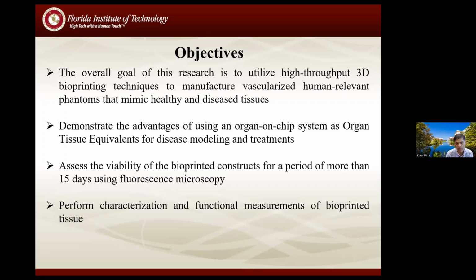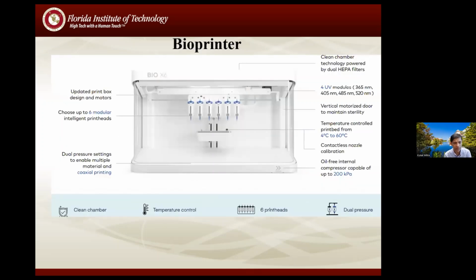But right now, we are targeting missions that will be more like 15 days, because we have to make sure that at least we can do that level convincingly. Or we are actually more at 30 days, but some of the papers are still ongoing, in publication and under review. So far, we have shown easily 15 days, and then we do a lot of characterization and perform measurements of these bioprinted tissues that can maintain the functionality of these tissue structures.